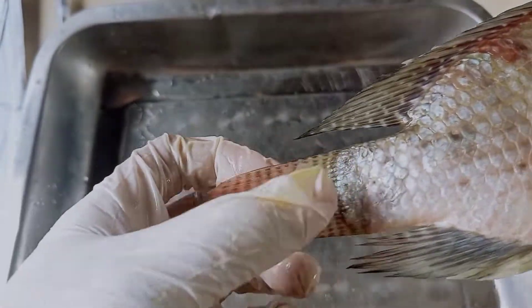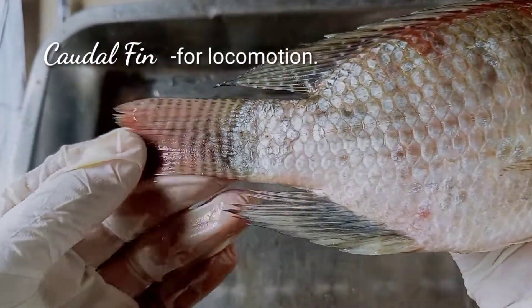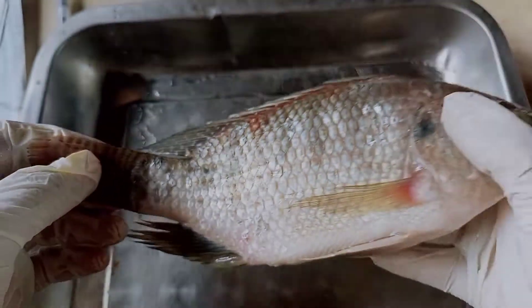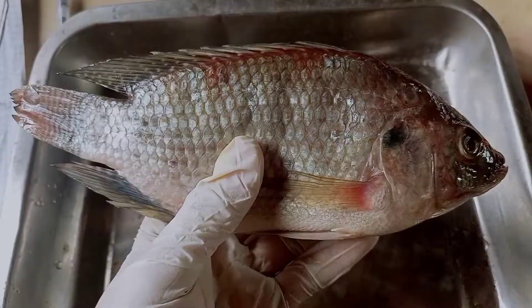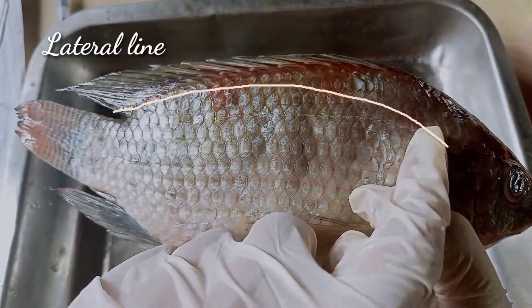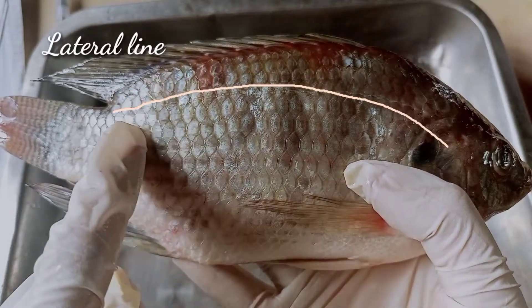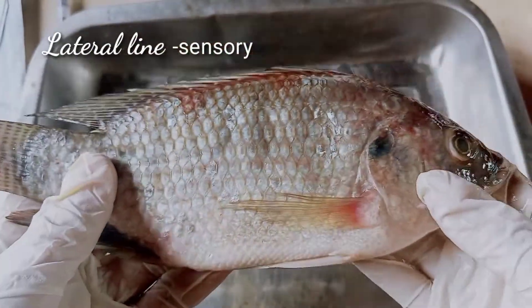And lastly, the caudal fin, which is used for locomotion. This is the caudal fin. Next, we have the lateral line, which serves as a sensory organ for our tilapia.